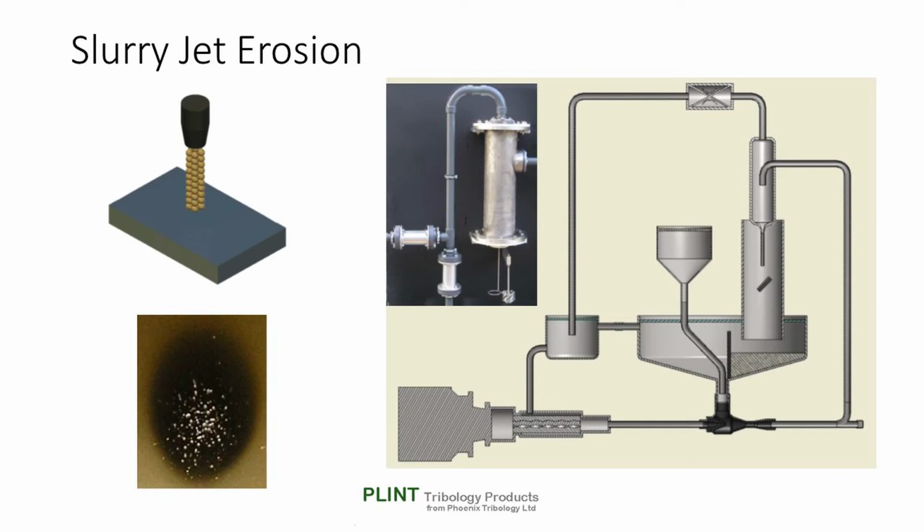The disadvantage of this type of rig is that the pump and valve life is dependent on the erodent used and may be unavoidably compromised. There is a free as opposed to an immersed jet in the design, and the use of a slurry pump makes this a potentially expensive solution. The advantages of this type of rig are that the angle of incidence is fully controllable and the erodent flow can be measured by time collection of flow in a measuring vessel.